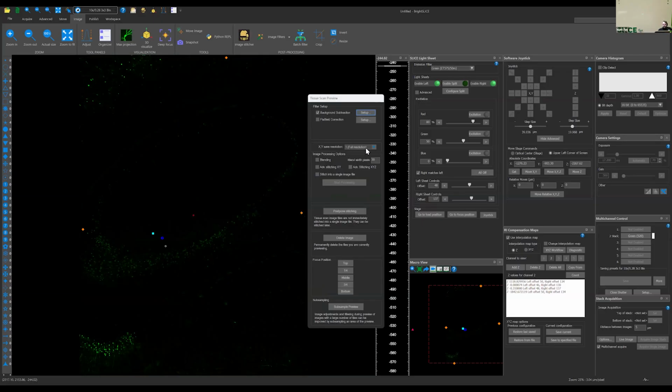We have different save resolutions we can turn on. We can actually downsample the image. Sometimes Slice has more resolution than you actually need. It's very likely that if you were just detecting somas in this sample, you could downsample this by a factor of 4, and be a quarter of the resolution without affecting your imaging result. That translates to a smaller file, something that's easier to work with in analysis and things like that. These are the data handling aspects that we have built into the software to make things easier for you and your pipeline. Finally, we want to do our advanced XYZ stitching.